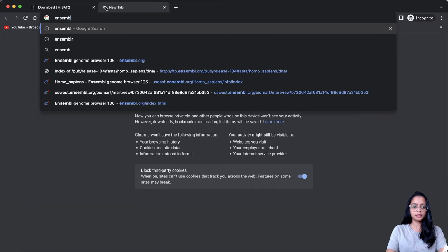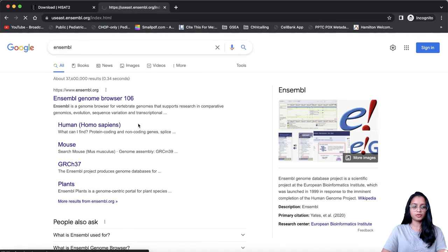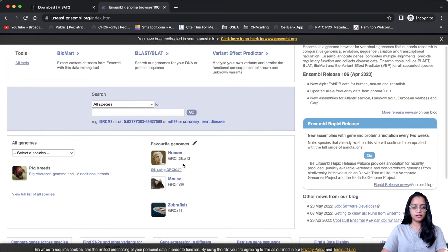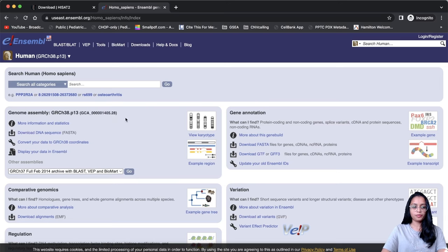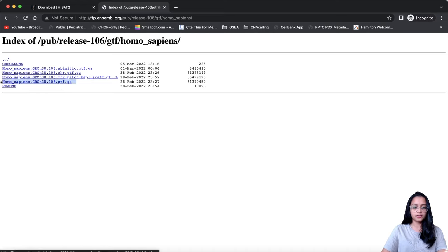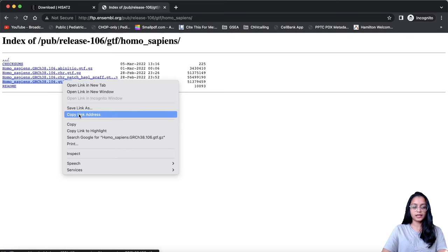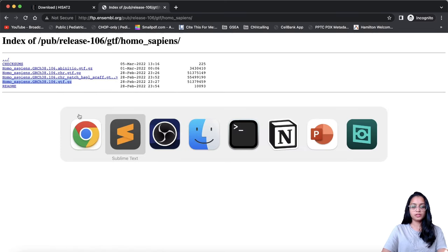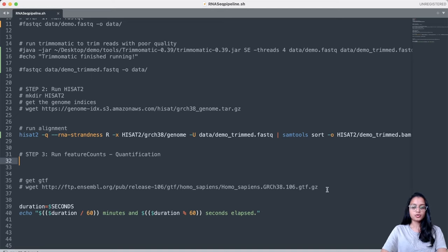You can go to the Ensembl website, click on Human, and find a panel for genome gene annotation. You can download the FASTA or the GTF or GFF3 file. Click on 'Download GTF,' which takes you to the FTP server where you can find the annotation file. Right-click to copy the link address, then in the terminal type 'wget' and paste the link to download. I've already downloaded the file, so I won't be doing that again.